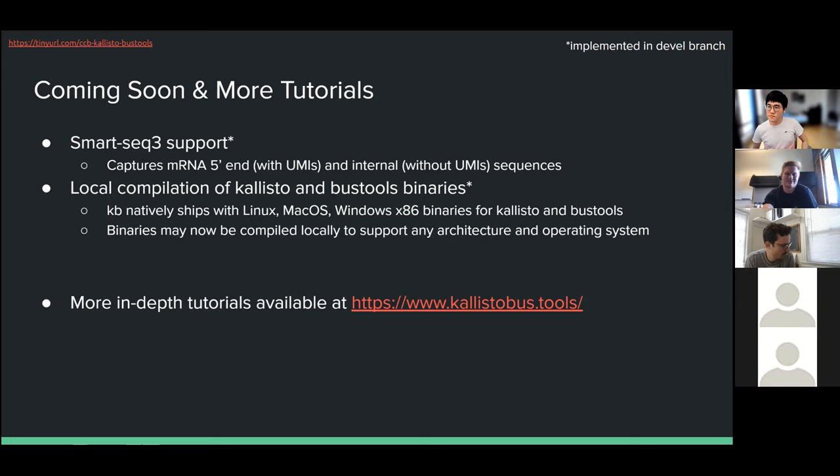Yeah, so that's my biggest interest in this as well, Matt. While a lot of people do have access to clusters, I know people that don't have clusters readily available or don't want to deal with the annoying red tape involved with public clusters, like Savio, for instance. I still use Cell Ranger, but I definitely know people trying to do single cell data that will likely encounter issues with that. So I'm just trying to compare alternatives, and this does seem much faster.